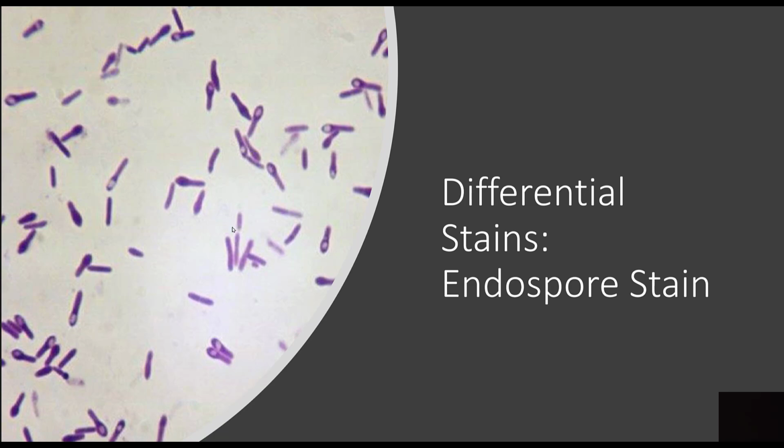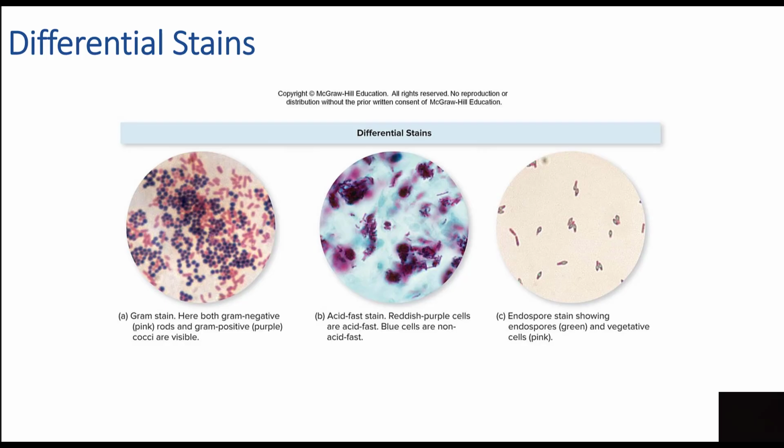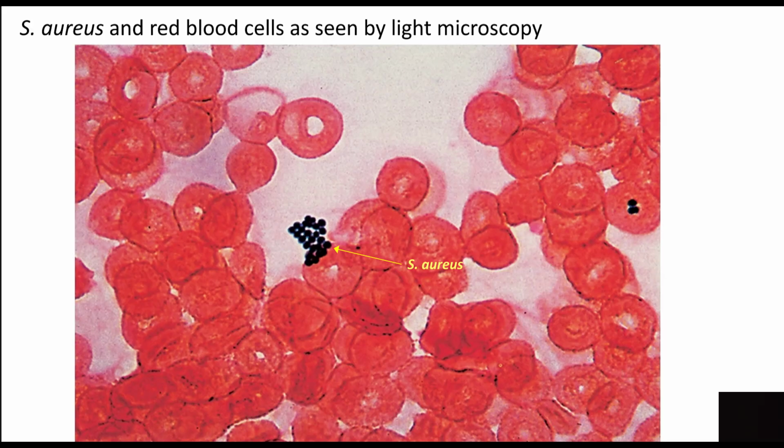The old mummy's tombs, and it's the revenge of, no, it's not. It's spores usually in the wrappings, and you breathe them in, and you can get into trouble with various things that Clostridia species are known for. So the differential stains, again, help us to distinguish between gram-positives or gram-negatives, or the acid fast if it's a tuberculosis, or endospores. And so we have a nice collection of those differential type stains.